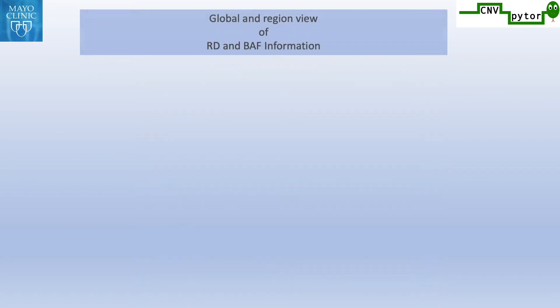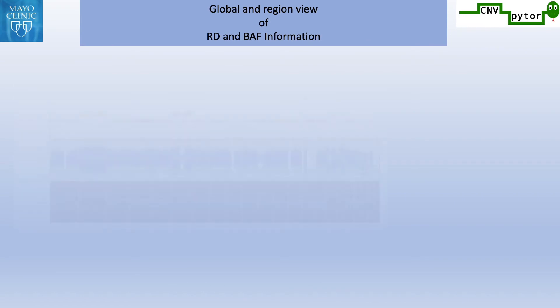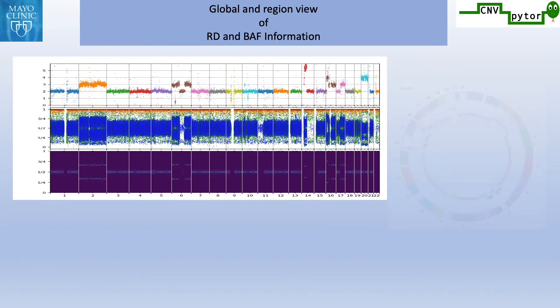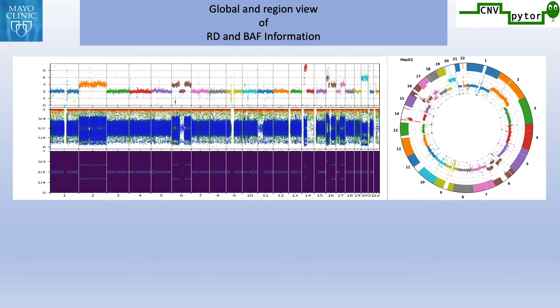Now let's have a look at the visualization features. We have linear and circular global view options. In the linear view, one can switch among multiple visualization panels. Here we have enabled three panels: the first panel is for read depth, the second panel is for BAF values of individual SNPs, and the third panel is for the BAF likelihood estimation function. One can see the same information in a circular plot as well.